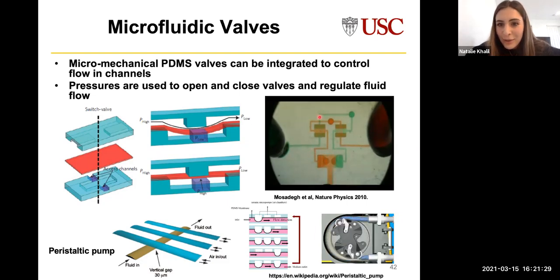Yeah, that should work. So we have two valves here that are enabling or inhibiting red or green flow. And you can see that that's controlling what flow enters this bottom chamber. So we're oscillating between green and orange flow.